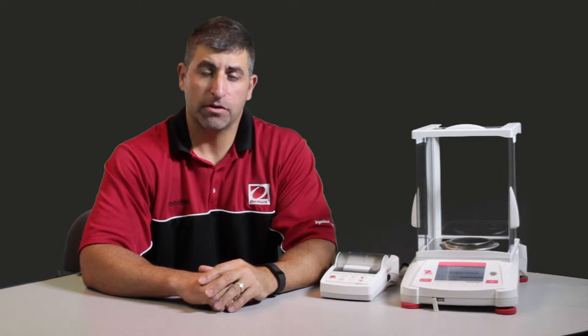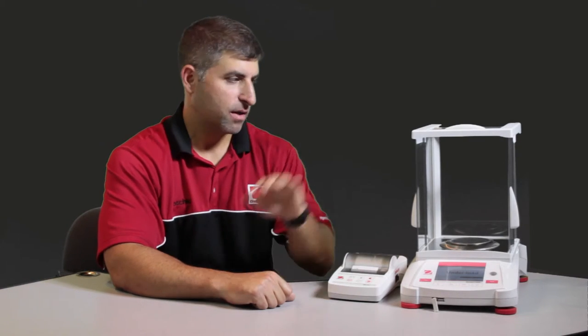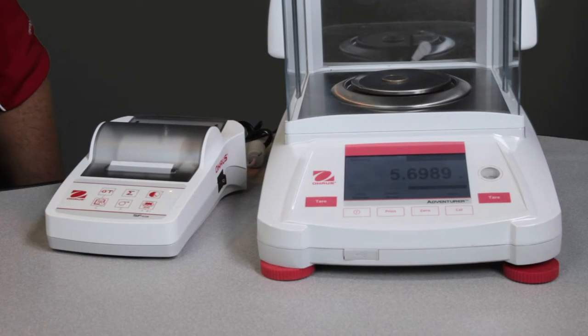It can be ordered with automatic internal calibration or external calibration. The Ohaus SF40A printer can be connected to the Ohaus Adventurer balance, and just the press of a button, you can get your weighing results.